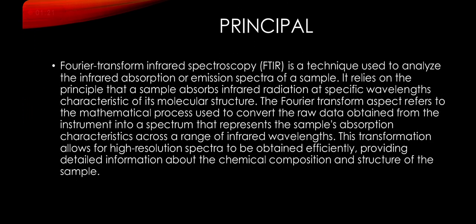Now we discuss the principle of Fourier transform infrared spectroscopy. It is a technique used to analyze the infrared absorption or emission spectra of a sample. It relies on the principle that a sample absorbs infrared radiation at specific wavelengths characteristic of its molecular structure.